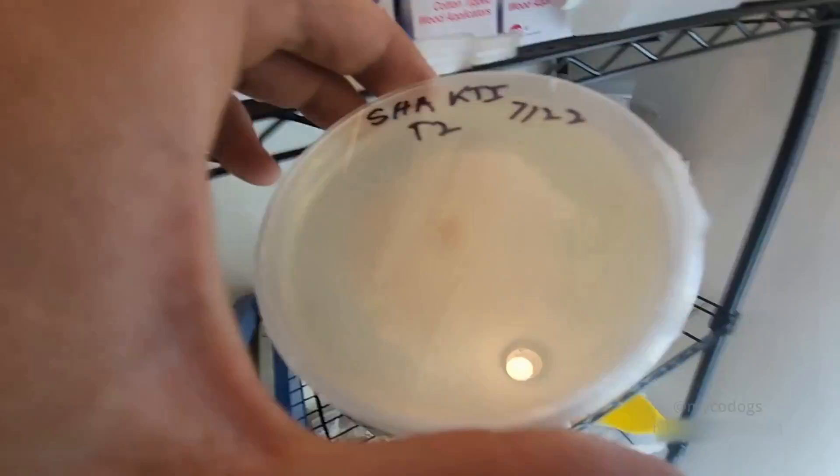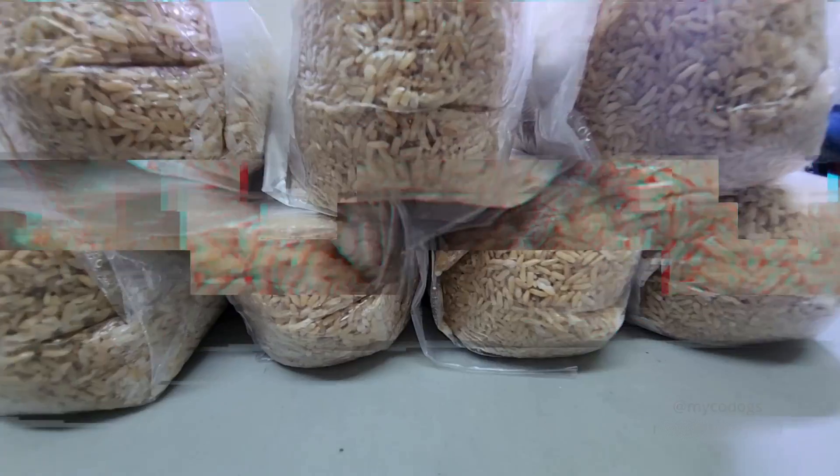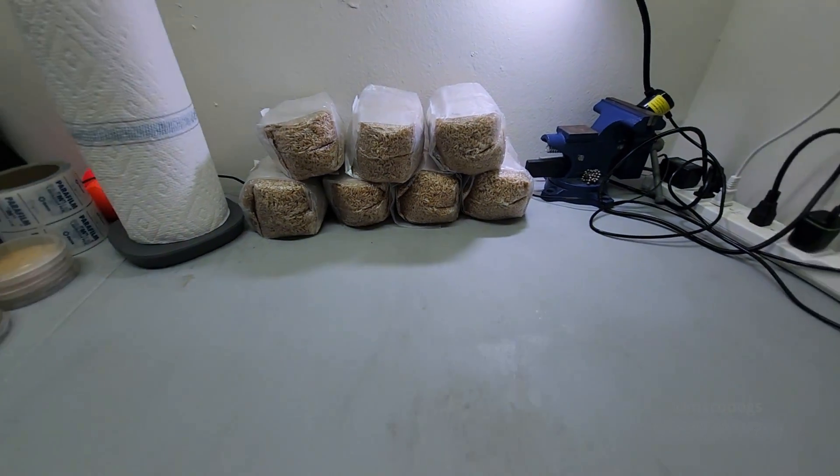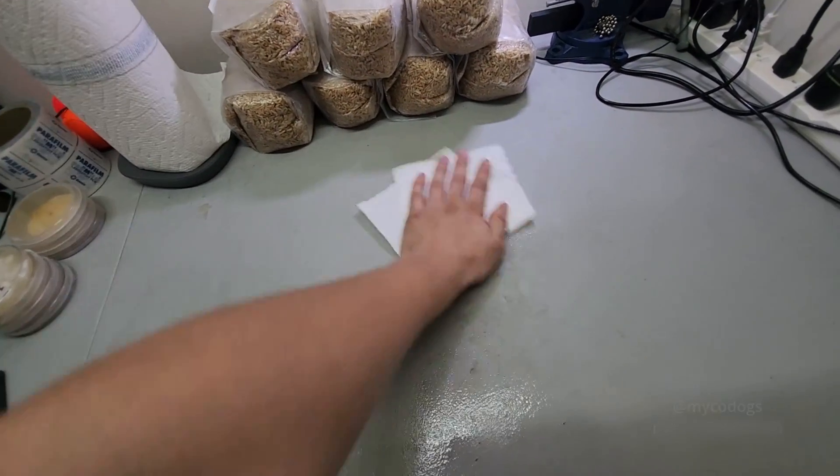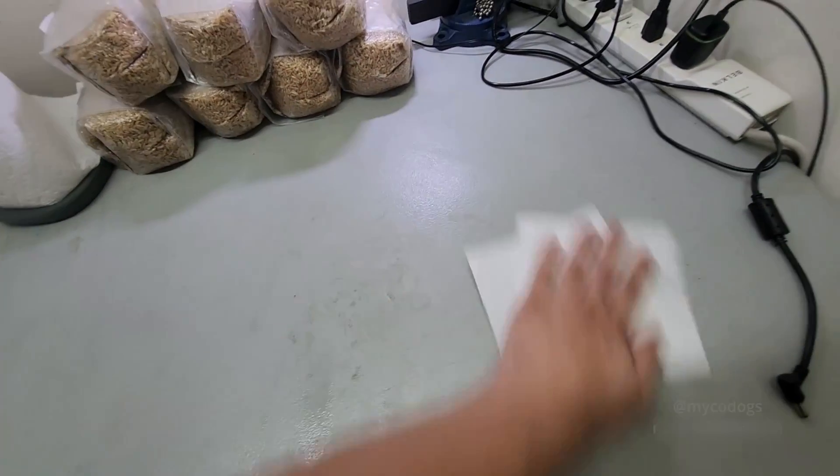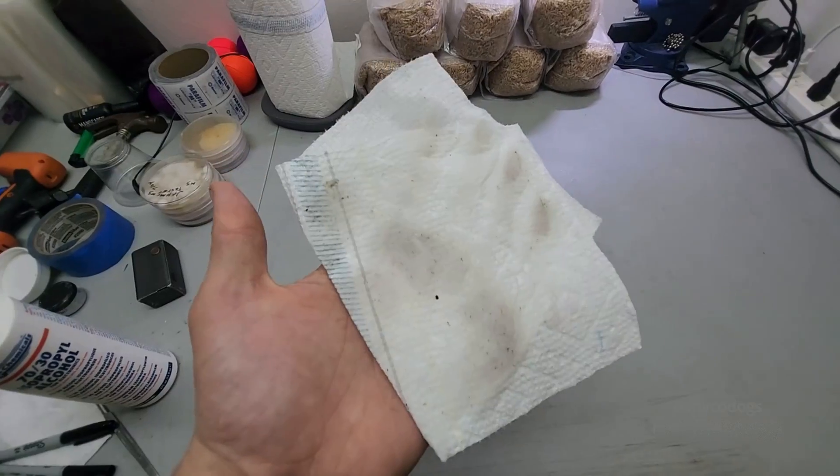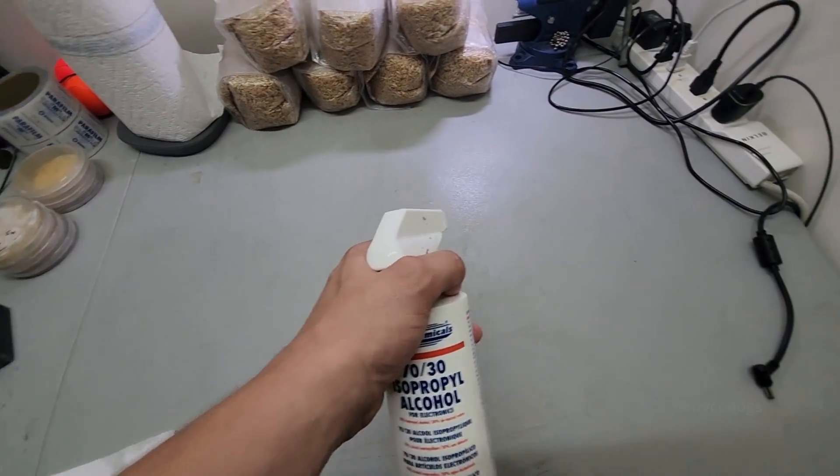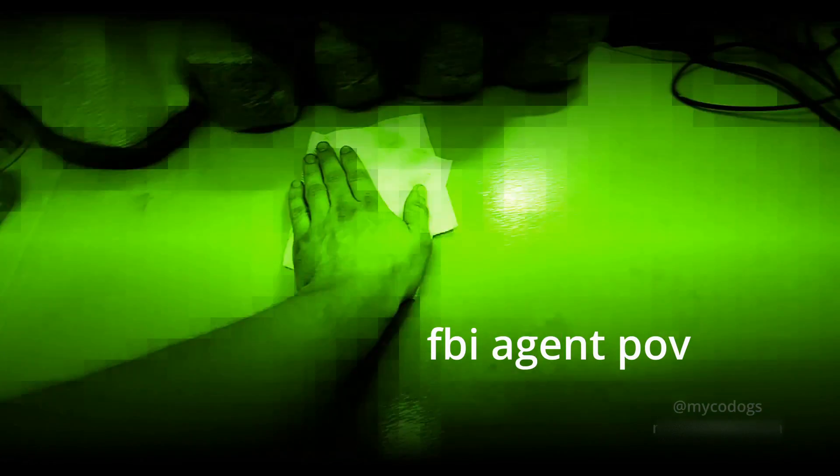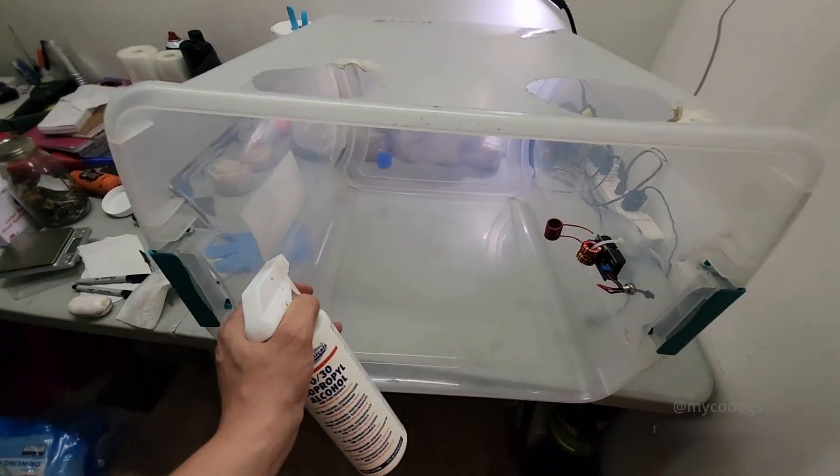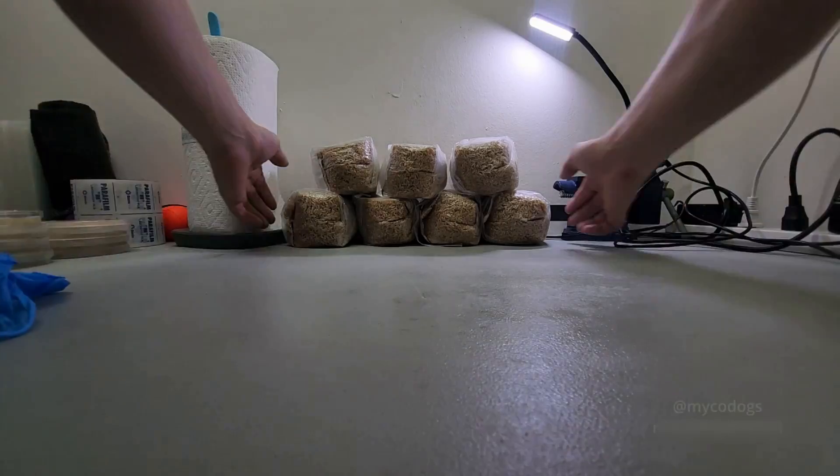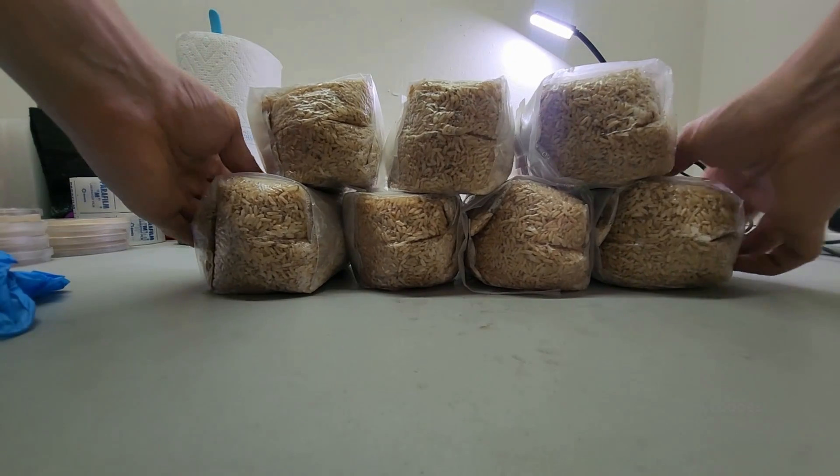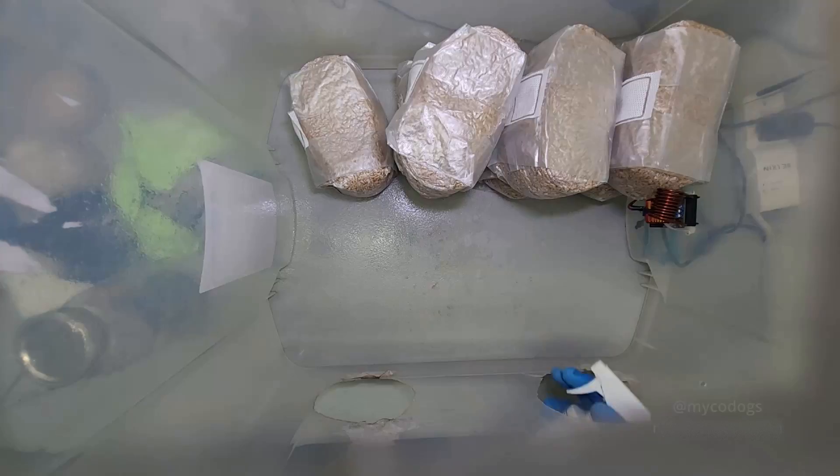All right guys, let's head over to the workbench. Wipe down the surface twice with isopropyl. In the majority of laboratories, it's protocol to wipe a surface twice in order to properly sanitize it. Spray down the inside of your still air box and wipe all the sides. After you've finished this, spray down the inside and let it sit for 15 or 20 minutes.